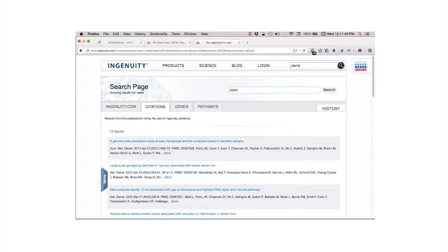So what they do is you go to a place like Ensembl, and I think it's BioMart, and you can convert identifiers and say, I have these corn genes. What's the closest human, mouse, or rat equivalent? And then you just basically fool IPA into thinking you're actually doing an analysis of human, mouse, or rat genes, and then you can get the result.